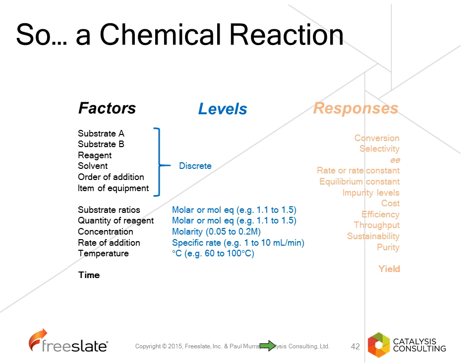So therefore, it is better that you measure your responses much closer to the actual reaction changes that you carried out. And therefore, I would recommend that you use conversion as a response rather than isolated yield.